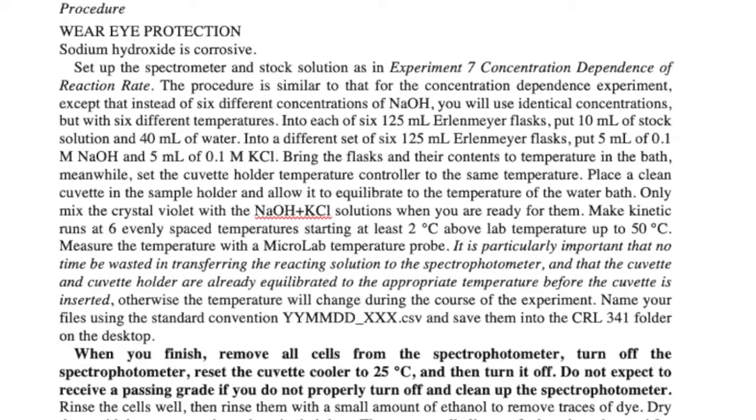If you change the temperature by 5 degrees, like we're doing today, between spots, then 0.2, 0.3 degrees is a good offset. If you're going to change the temperature about 20 degrees, it may blow through it by half a degree or more. And so you would appropriately set the temperature first to a little bit lower, allow it to go past that, and reset it to the temperature you actually want it to be. You have to make sure the temperature of the bath and the temperature of the cuvette are the same before you start taking data, and that they've equilibrated, so it's not still trying to feed back and change that temperature. You want them to be the same.